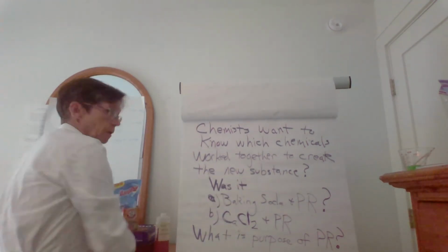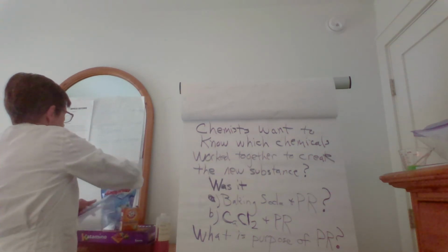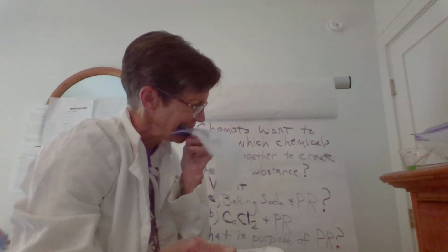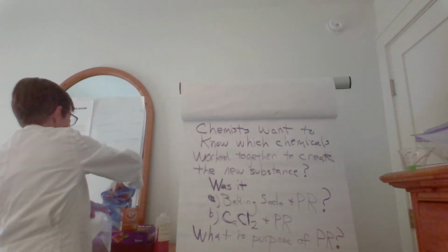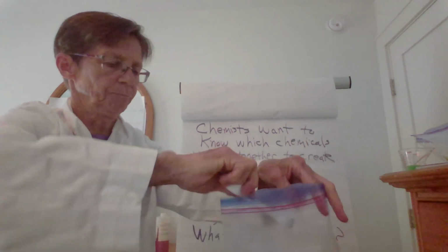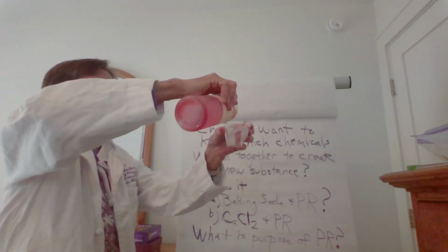All right. I'm going to get my measuring with a new bag. I'm going to put 2 in here because it said 2 in the beginning. That's an interesting question, that ratio. All right. There's 1. Okay. Near those Dippin' Dots, I'm trying to show you, but the best way I can. Okay. All right. Now measure out some more phenol red. I keep moving all my stuff all over the place.